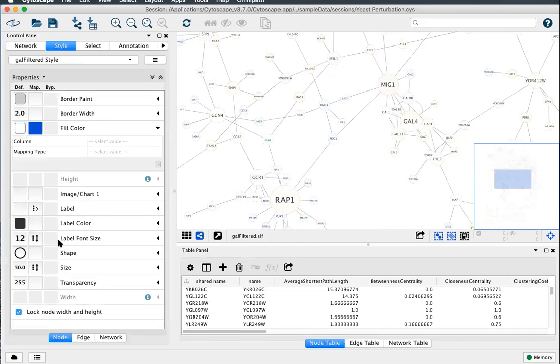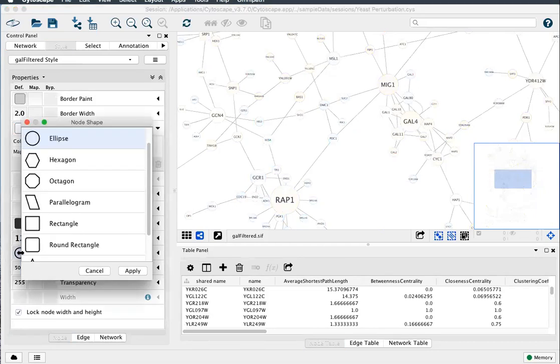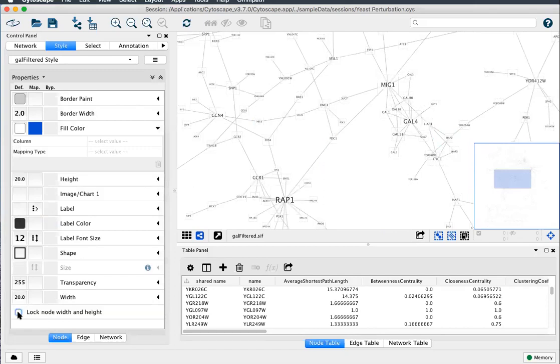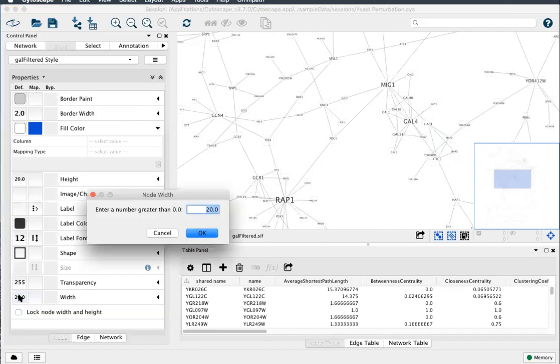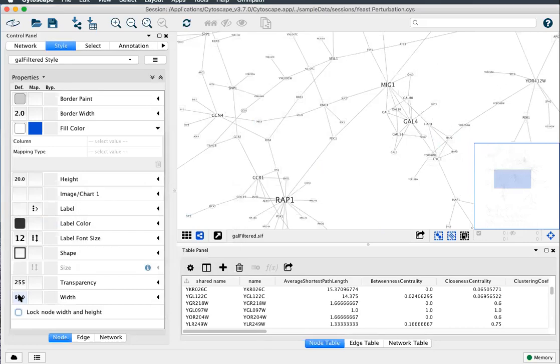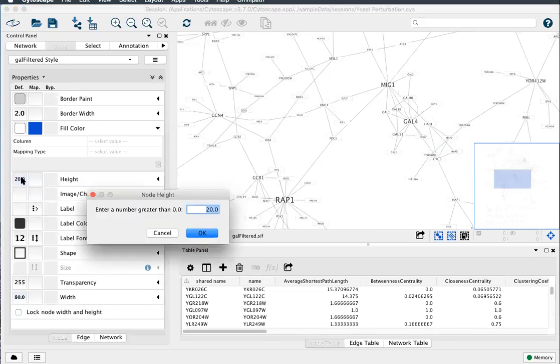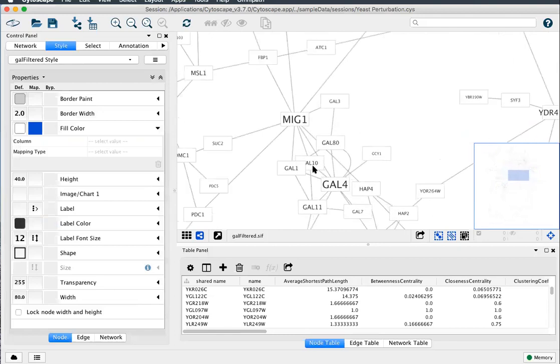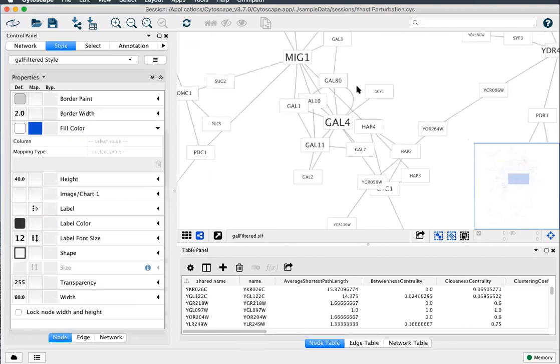Let's set our node shapes to rectangular, default rectangle, unlock node width and height so we can get rectangles instead of squares, and update the default width to 80 and the default height to 40. Okay, there's some nice rectangles.